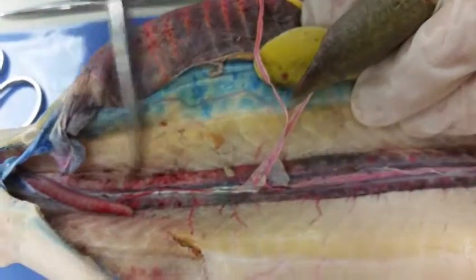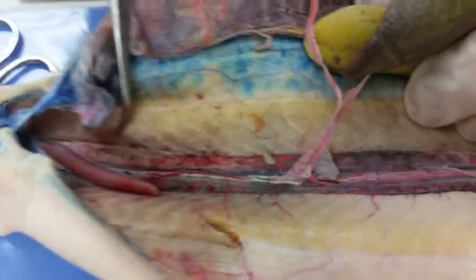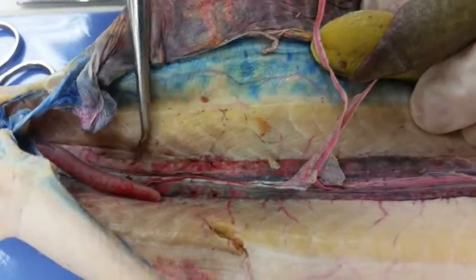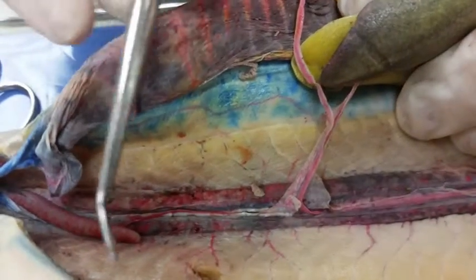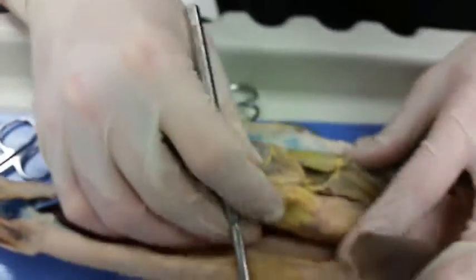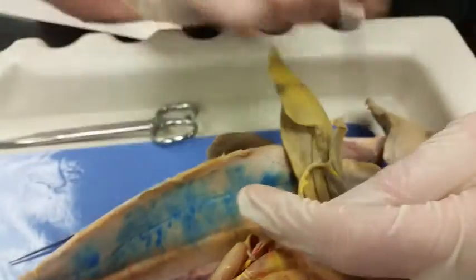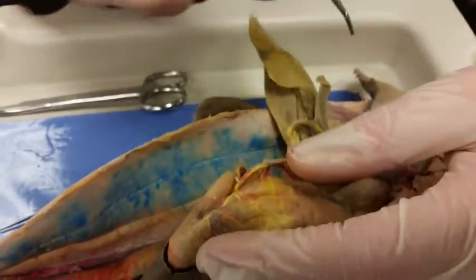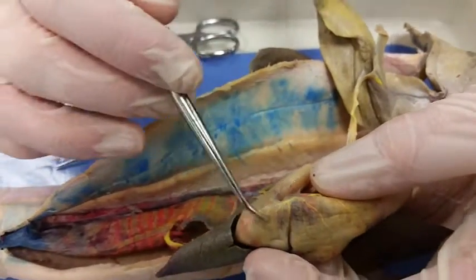It's eventually going to lead us down by the kidneys, all the way down here near the rectal gland. So rectal gland, kidneys, mesocolon up through here. That's how we need it to be. We have liver, 2 liver lobes. We have the duodenum through here.